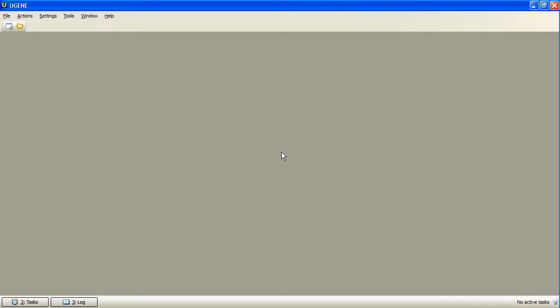UGENE package contains pre-built profiles for over 90 sample sites, but our users can also create their own profiles of TBFs alignments.